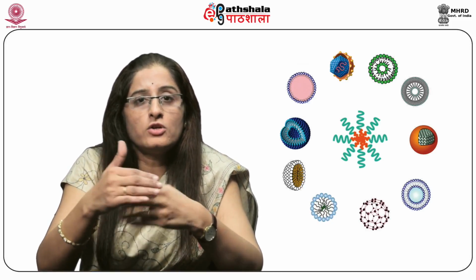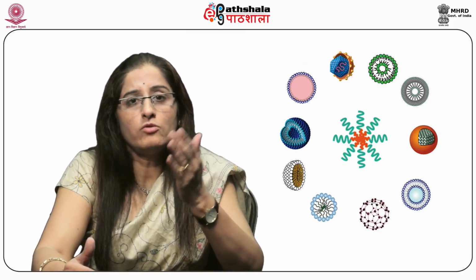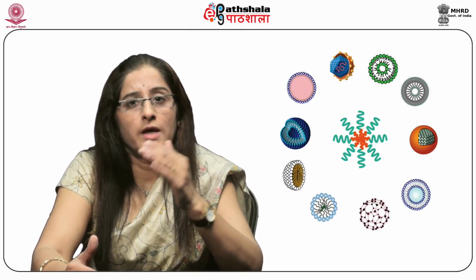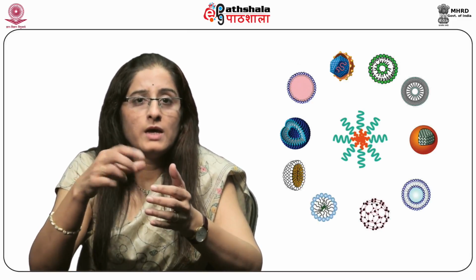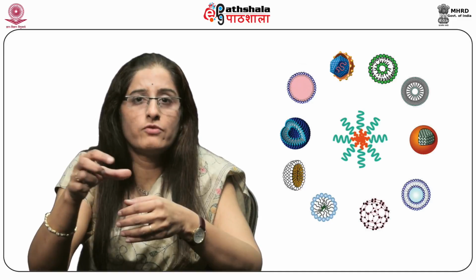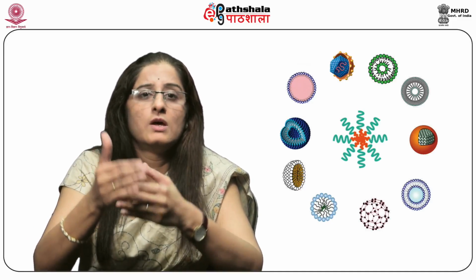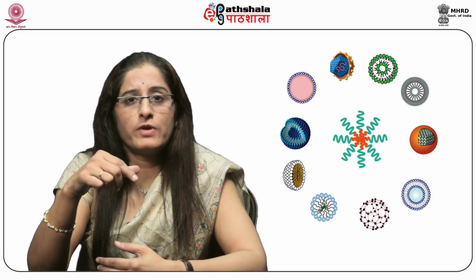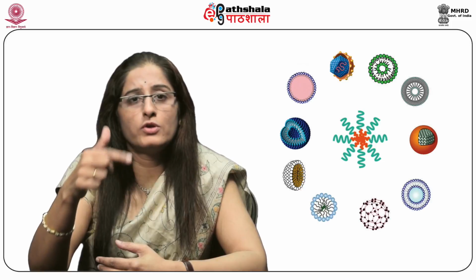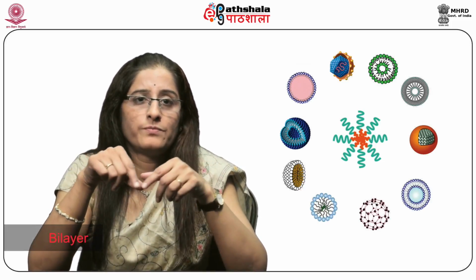Next, the hydration of lipid film is done. It is achieved by adding an aqueous solvent into the round bottom flask and agitating it in such a way that the aqueous media constantly move over the lipid film. Addition of the aqueous phase causes the lipid molecules to arrange themselves in the form of bilayer.